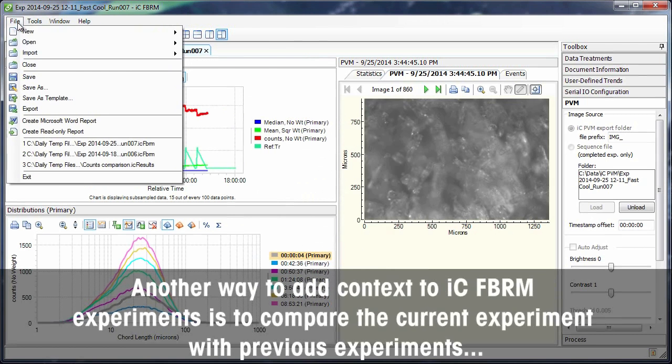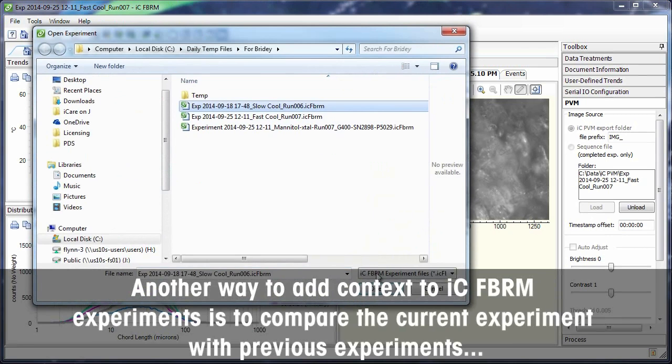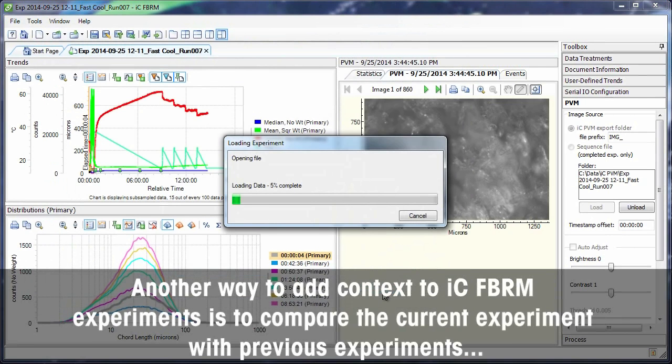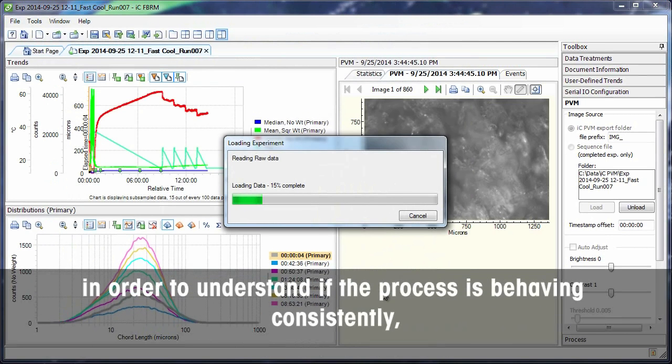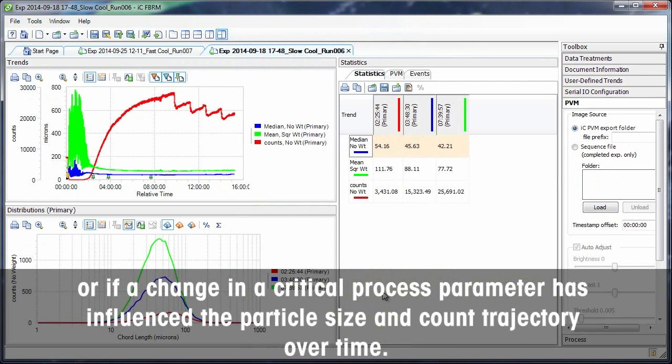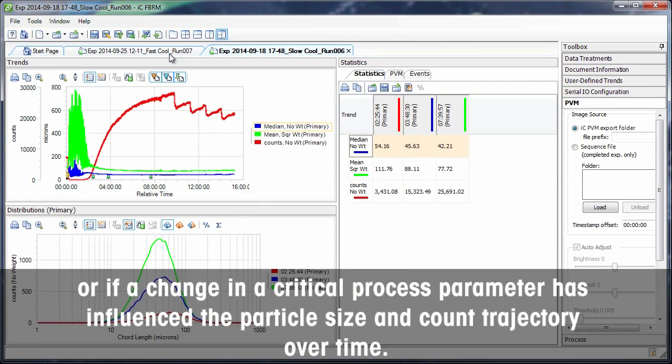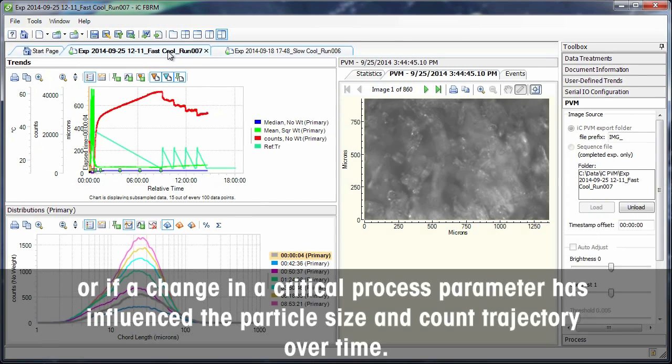Another way to add context to ICF-BRM experiments is to compare the current experiment with previous experiments in order to understand if the process is behaving consistently or if a change in a critical process parameter has influenced the particle size and count trajectory over time.